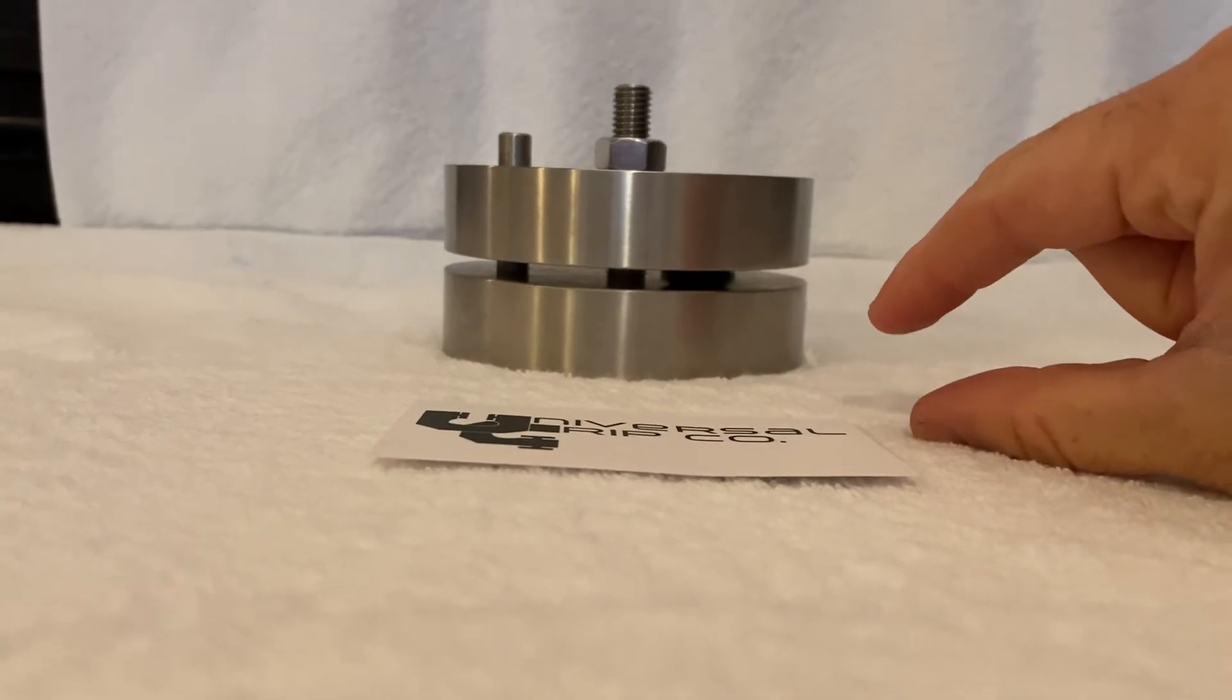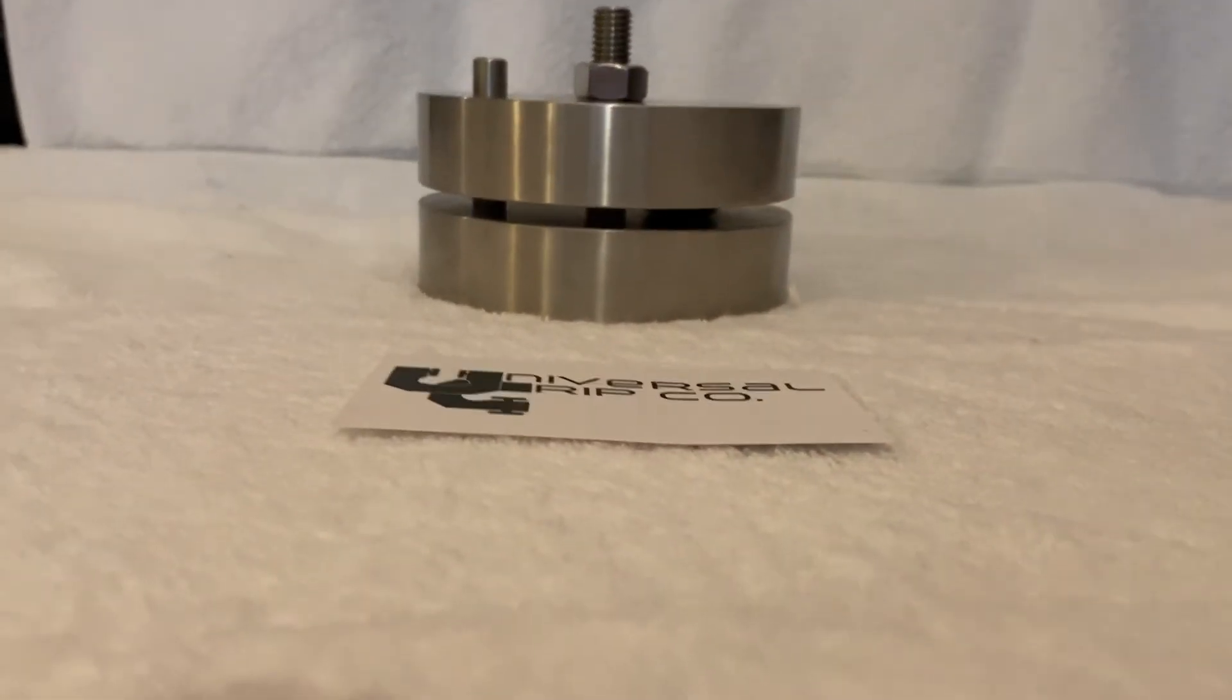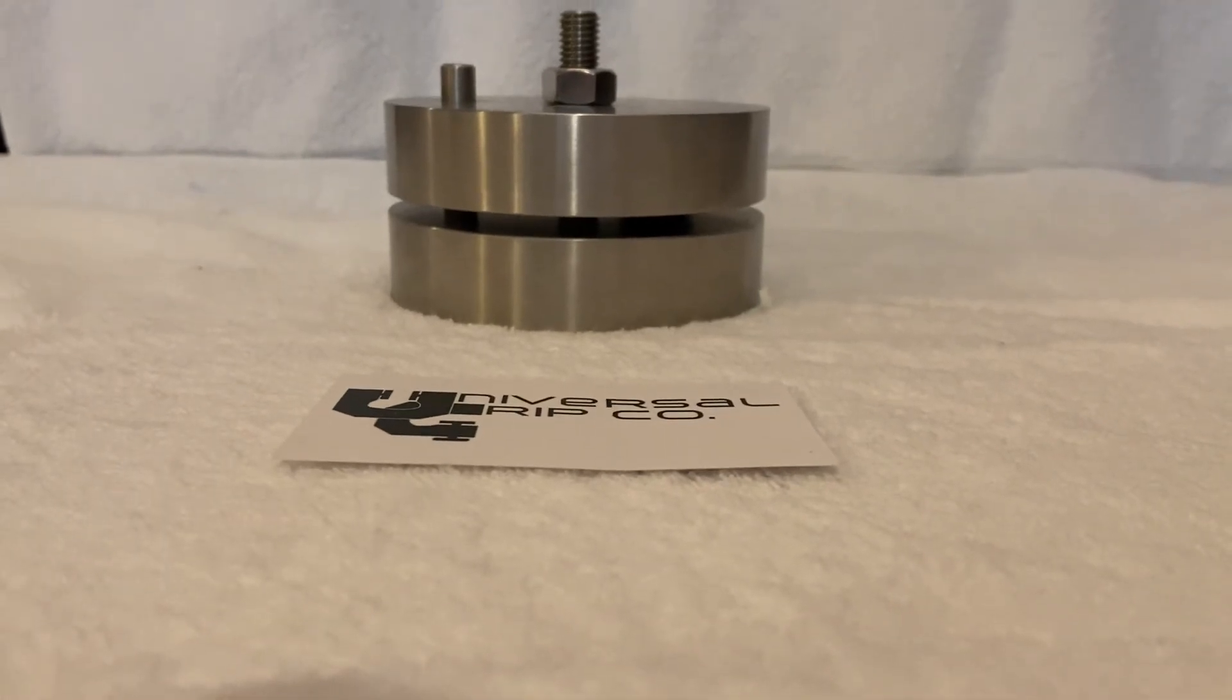You then take the sample out, measure the height again, and compare that to the original sample. That's called your compression set.